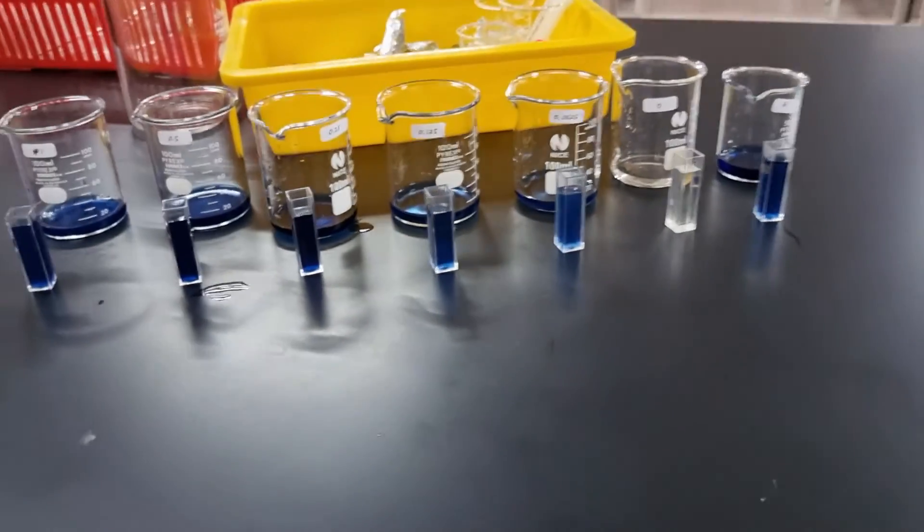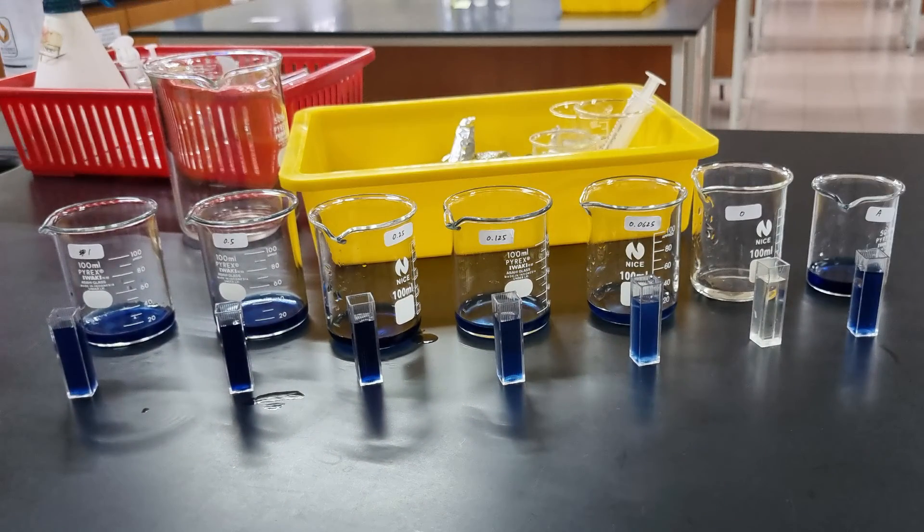We can see here that 1% would have a darker appearance, and 0.0625% would have the least color intensity, so a lighter blue in comparison. Of course distilled water and iodine is just yellow color because it has no starch in it. With this, we can actually record our qualitative test results.